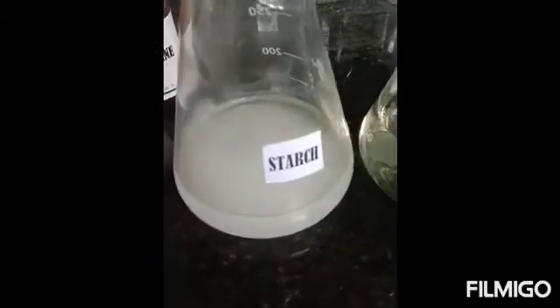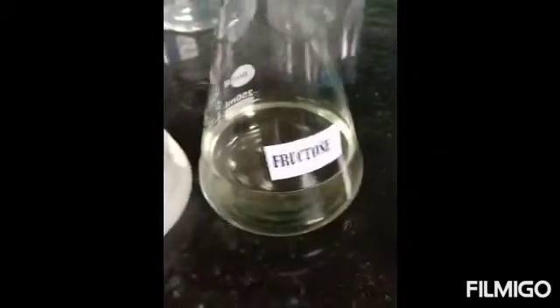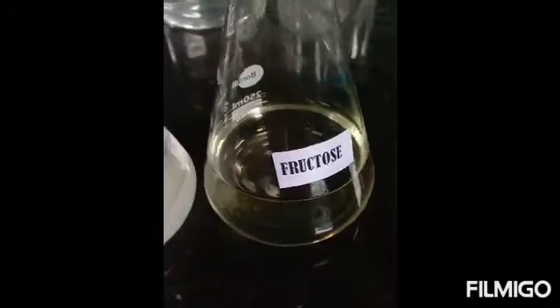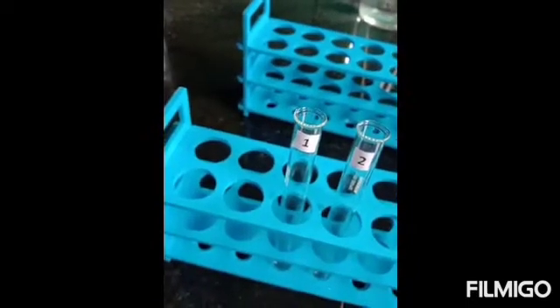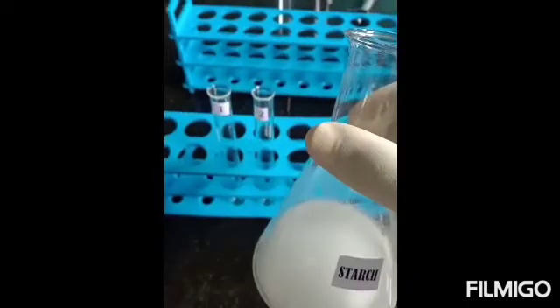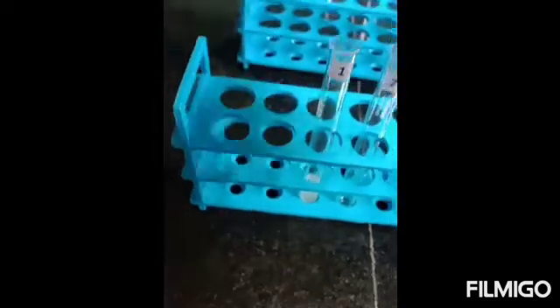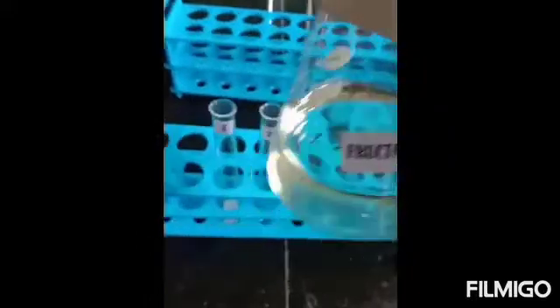We have taken 1% starch solution and 1% fructose solution. Starch gives a positive iodine test and fructose is taken as a negative control. To the first test tube we add approximately 2 ml of starch, and to the second test tube approximately 2 ml of fructose.